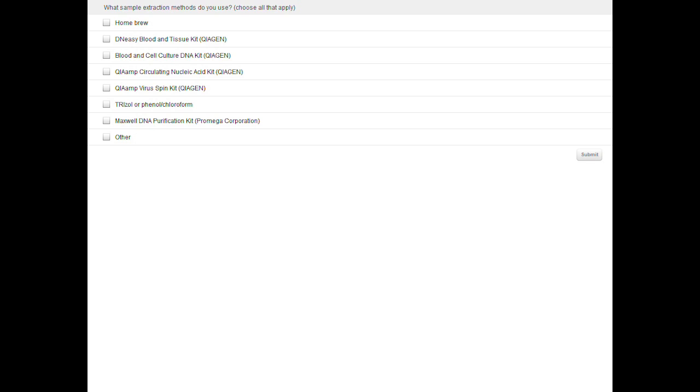So another thing that we're finding to be very important as this process moves forward is that the sample extraction method that you use is critical. So what we wanted to know here is what sample extraction methods do you use? Please choose all that apply.